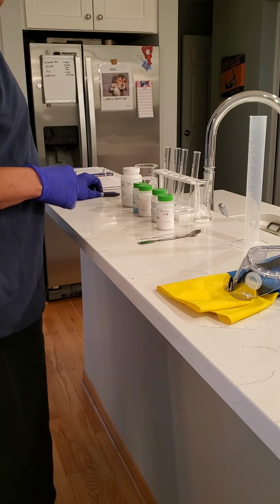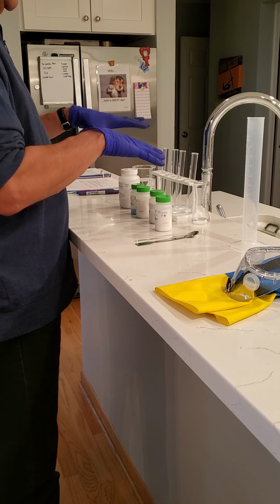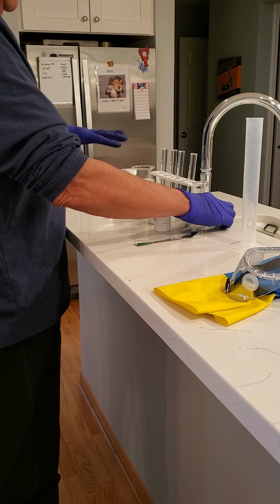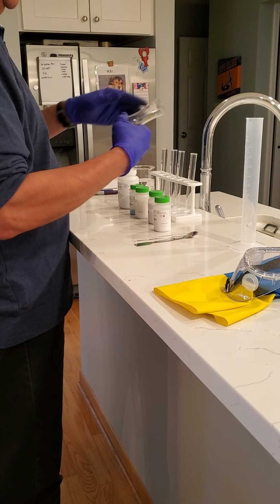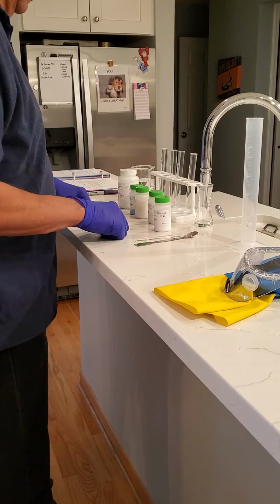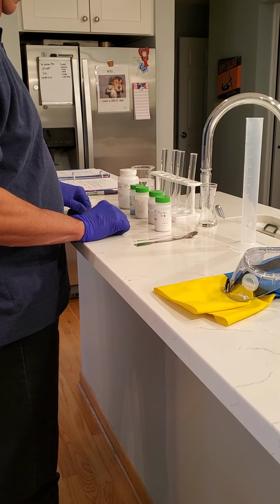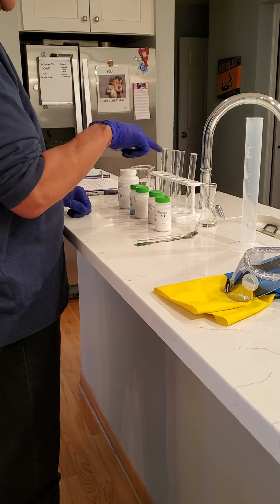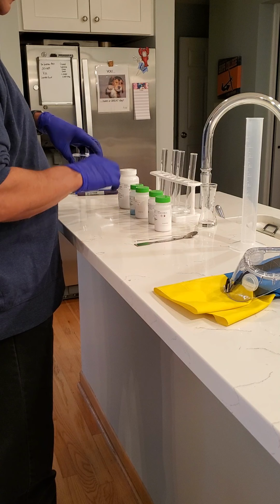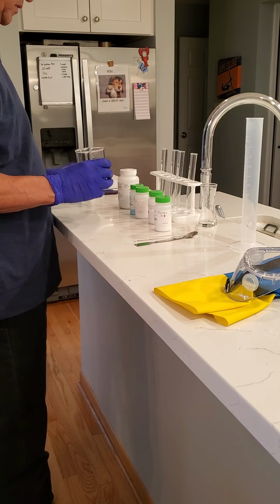Okay, class, so for this first part, the qualitative measurement, what you're going to do is set up your test tube rack with some test tubes, and I only had 4 test tubes. We actually need 5, so I've found this little glass container that I'm going to use for my 5th test tube. If you don't have a 5th one, then you can just reuse one of the 4 that you have. I've numbered the test tubes 1 through 5 for the 5 solids that we're going to measure in terms of solubility.